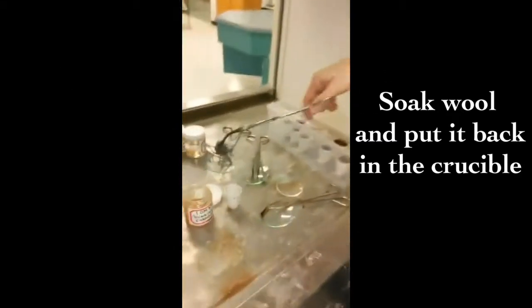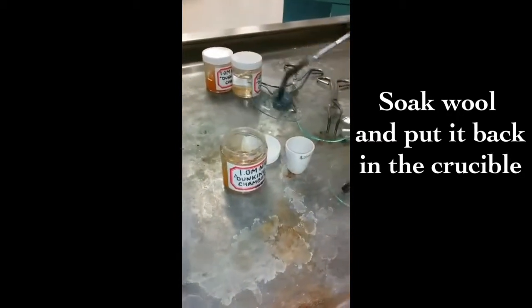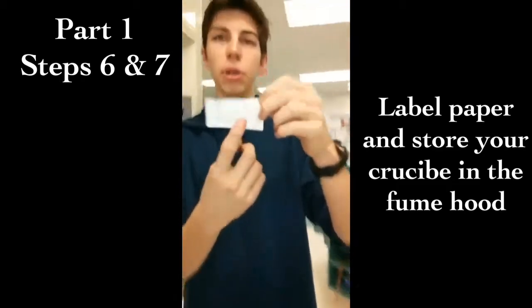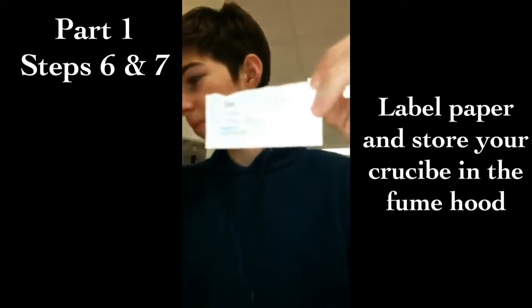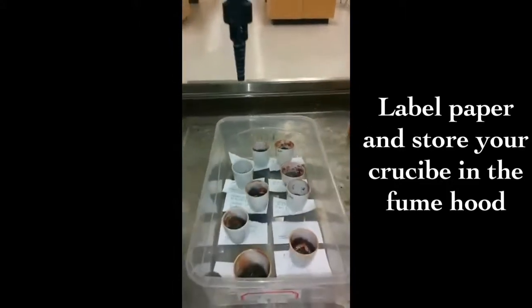Now that we're done with steps 1 through 4, let's do step 5. I'm going to take my steel wool, dunk it in the ammonium chloride, let it soak, and put it back in the crucible. For step 7, take a piece of paper and put your block, class, and names on it. Lastly, put your crucible right on top of the paper. Now the waiting begins.